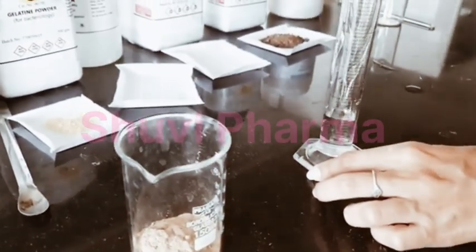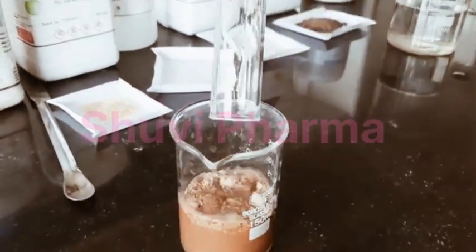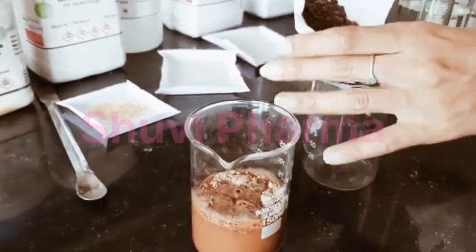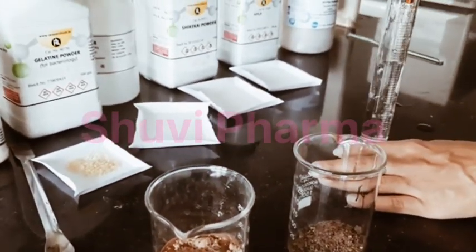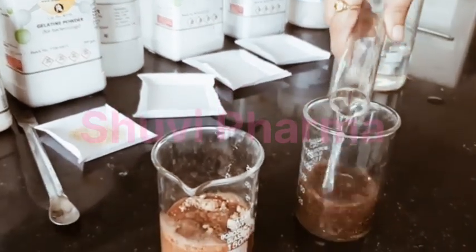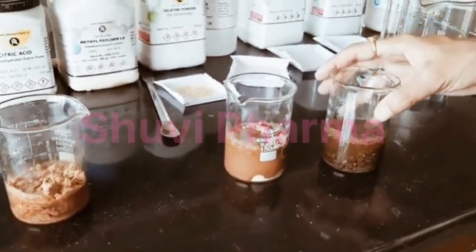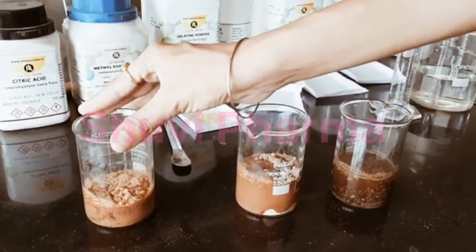For that we will add 10 gram of shikakai powder with 50 ml of water, and the last extract, that is amla, 10 gram of amla powder and 50 ml of water. So for preparation of extract, we will boil shikakai extract and amla extract, and for Reetha extract, cold maceration is there, so we will keep aside for some time this Reetha powder with ethanol.